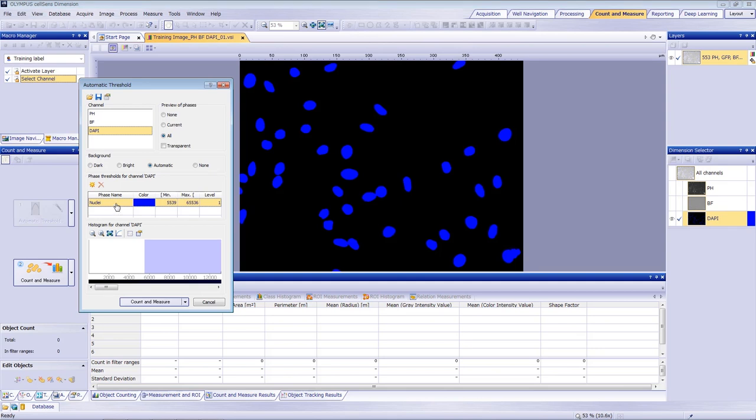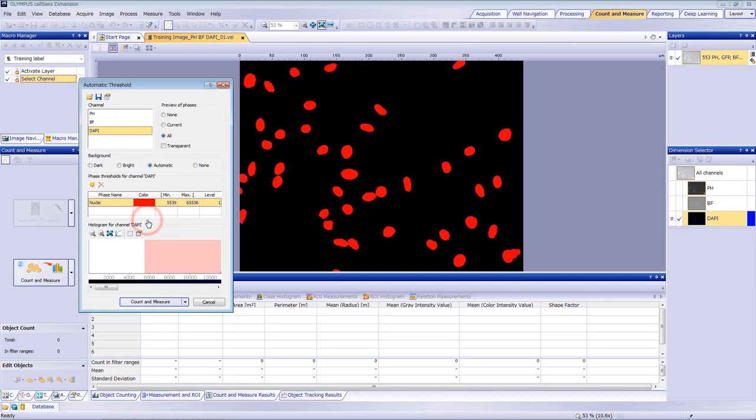Later, we'll use this as the name of the training label. Select the color from the dropdown. Use a different color from the DAPI channel and other phases. We chose red. Then click Count and Measure.